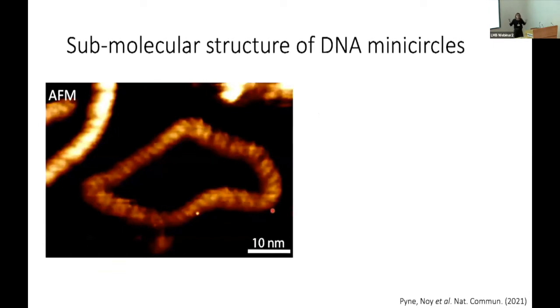Well, the first thing we did was make our system smaller and more discrete, because plasmids are actually quite big on an AFM scale. They're quite flexible. I can get into convoluted messages about headphones and how things get entangled. But really what we did was make small mini circles, twice the persistence length of DNA. And the reason for that is basically a discrete entity.